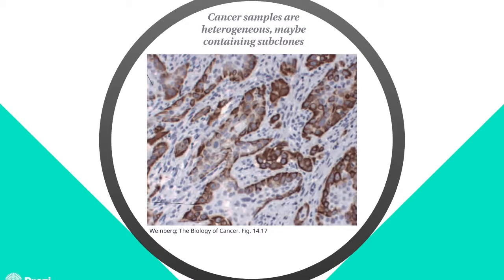So people who are interested in cancer do know that the samples that we are usually getting are pretty heterogeneous, containing different subclones, and not that straightforward to analyze as usual blood samples, normal samples.